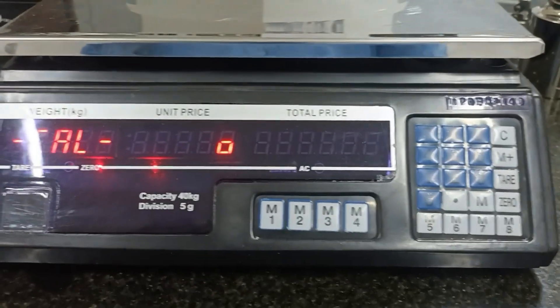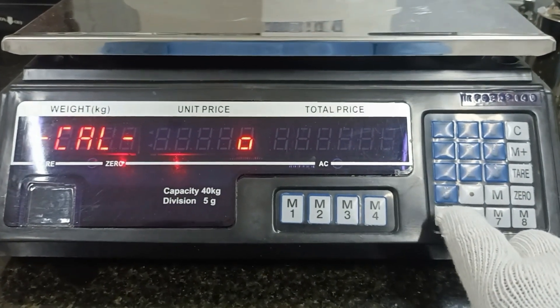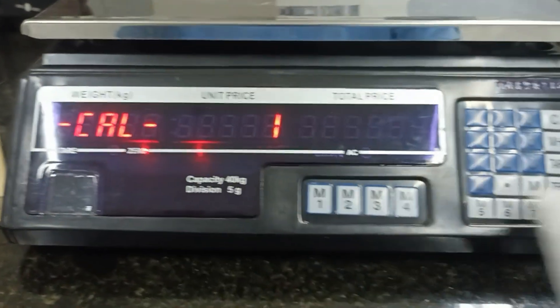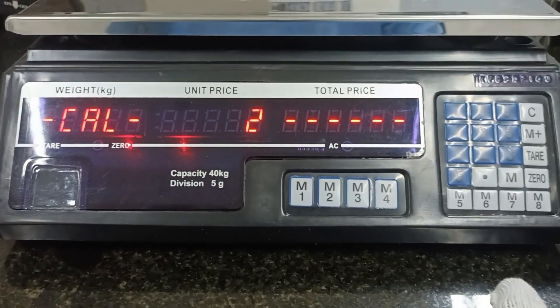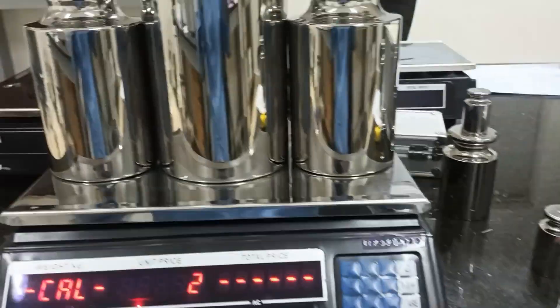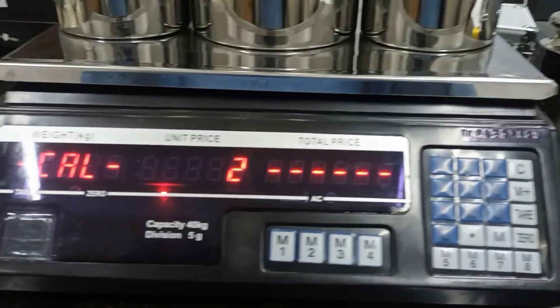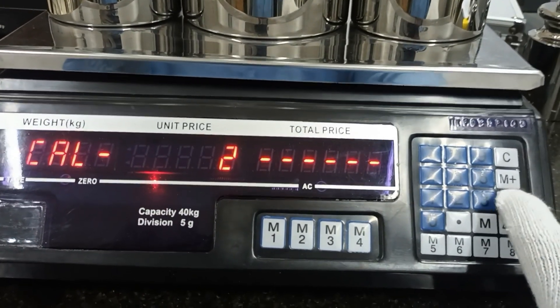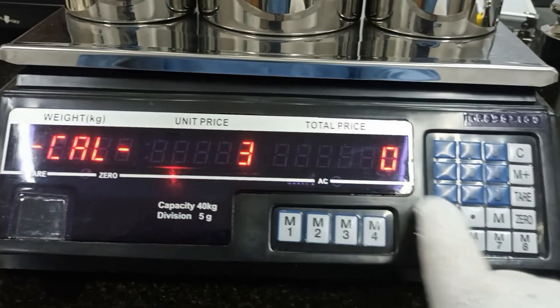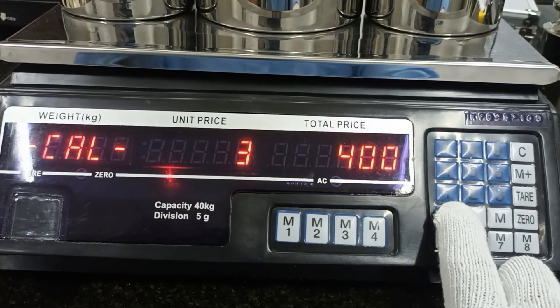Hello everybody. Now I will do the adjustment for this balance. First, I will put the key card and select number one and number two. This one I will put to standard full. And I will spread here — this will be to set the capacity for calibration.